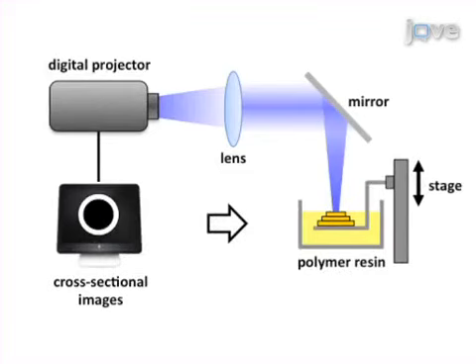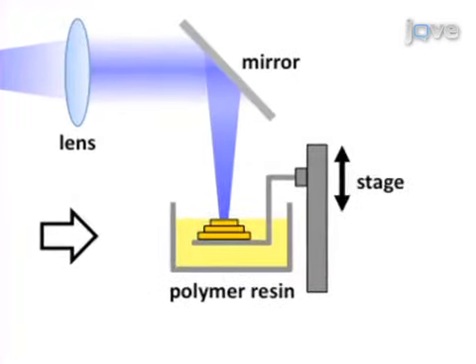with different dimensions. Fabrication of the tubular gel samples is achieved by projecting a designed image onto the sample holder, which is immersed in a resin bath containing a pre-polymer solution with photoinitiator and photoabsorber. Once a layer is formed by photopolymerization, the sample holder drops and the next layer is fabricated on top of the previous one. In this way, a 3D sample is fabricated in a layer-by-layer fashion.